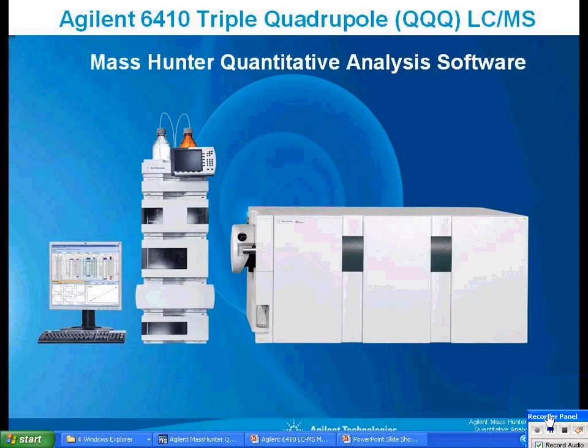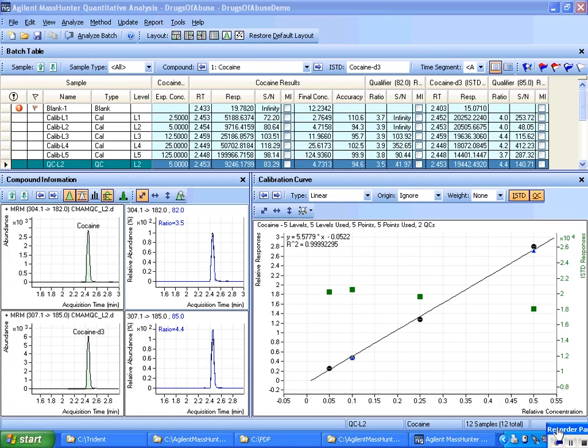Let's take a moment to look at the capabilities within Batch at a Glance in terms of printing and print preview of both the batch table and the graphics. If you want to have your graphics, let me show you how to export the graphics.